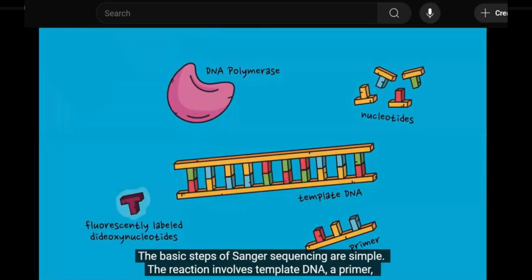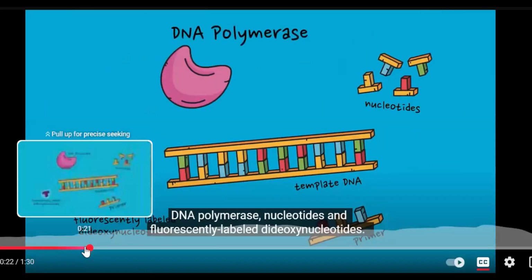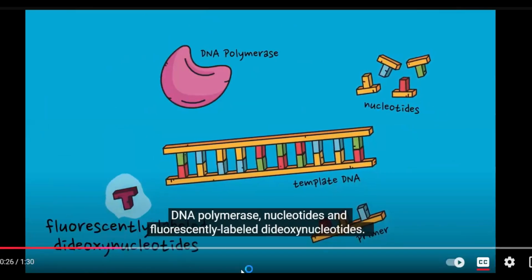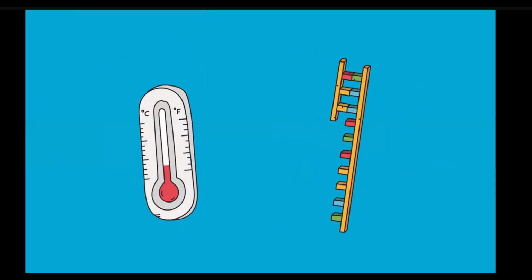And you can see the polymerase is extending the DNA, and at the end you are going to have the fluorescent tag and DNA fragments generated of different sizes. Shall I repeat? Just watch. So the fluorescent label is added. Dideoxy. The temperature is such that DNA denatures.